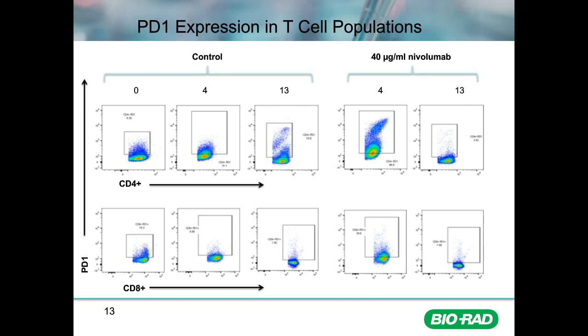By day 13, expression of PD-1 was higher in the control than the treated within the CD4 compartment, whereas both treated and untreated CD8 T cells expressed similar levels of PD-1.